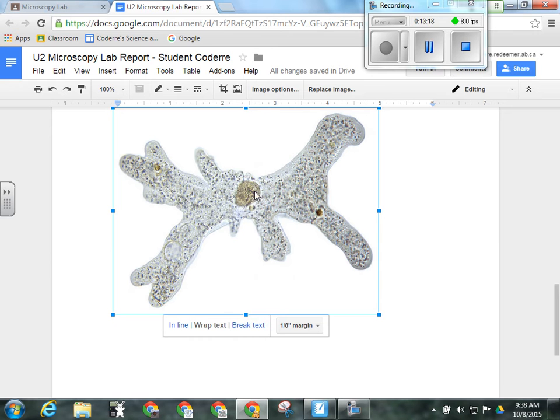Incidentally, that's what some amoebas look like. Every amoeba looks different because they're a purple blob, and it kind of depends what they were doing at the time they got put on the slide, what shape they have. Incidentally, all the things you're going to be looking at tomorrow are dead, so they're not going to be moving around on the slides. They're cemented onto the slide.